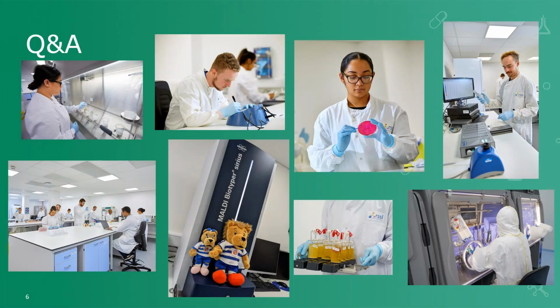Hi Tim, thanks for that. We've had a few questions come through, so I'll see how many we can get through. First, I've got a question from Kelly that I thought was quite amusing. With feet being such a source of microorganisms, isn't it better to keep cleanroom operatives' personal socks on rather than remove them, causing displacement when they change into their cleanroom socks?